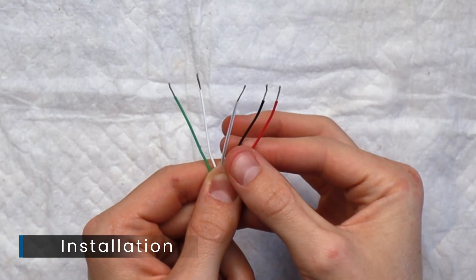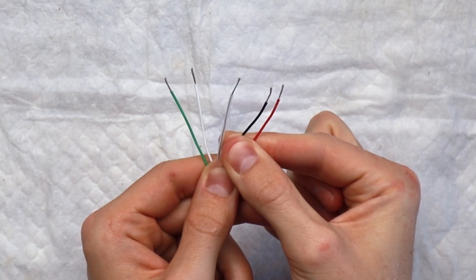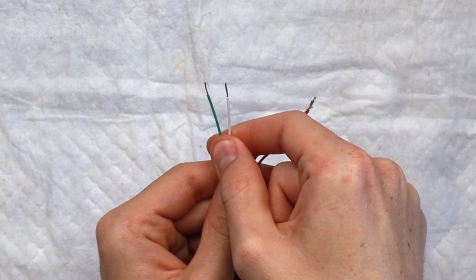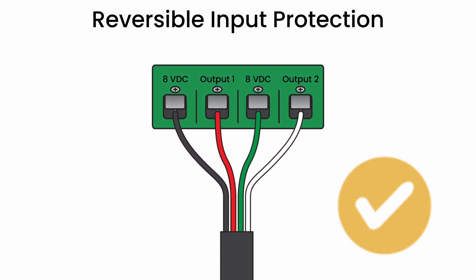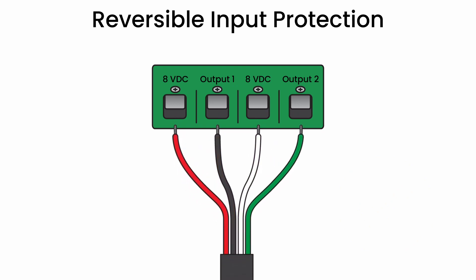Your sensor is now ready to be connected for calibration. The red and black wires are for the primary parameter — either pH, ORP, dissolved oxygen, or conductivity — while the green and white wires are for connecting the optional temperature sensor. Each pair of wires has reversible input protection, meaning either can be used for power or the signal, making wiring extremely easy.